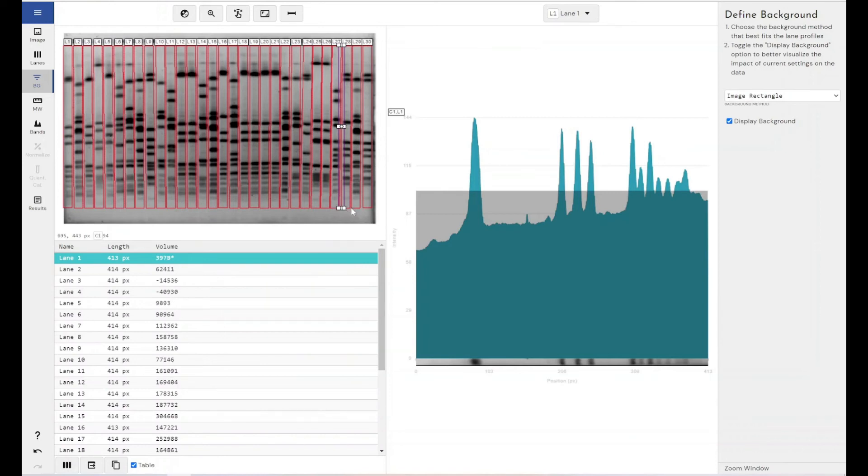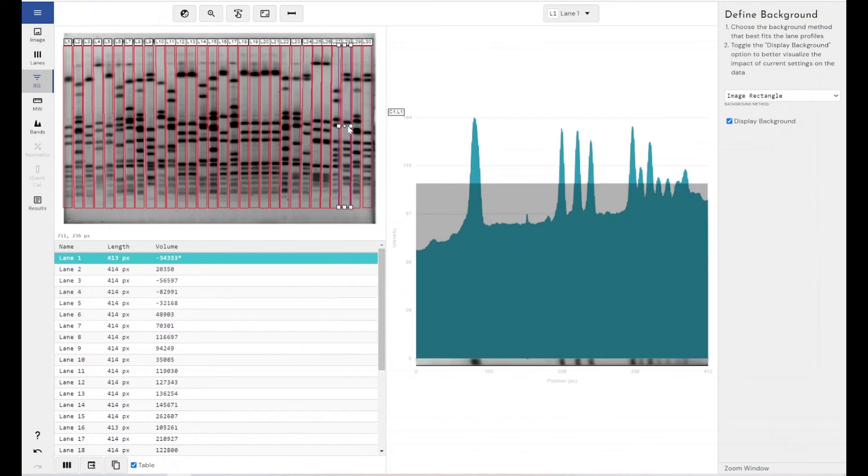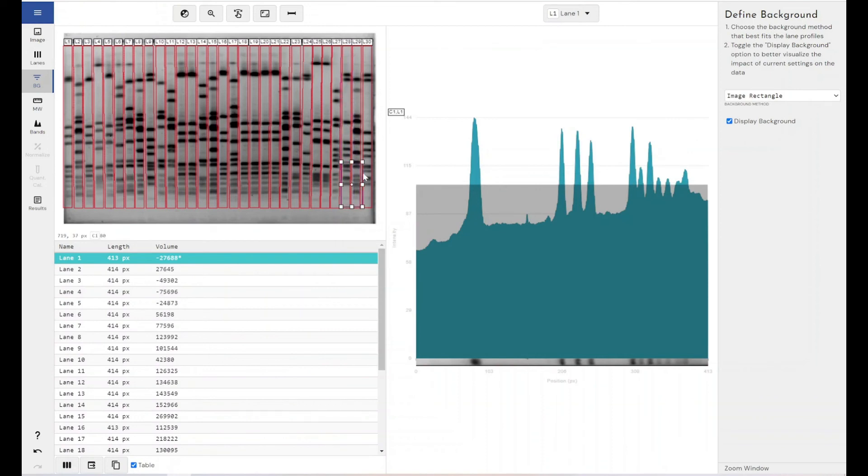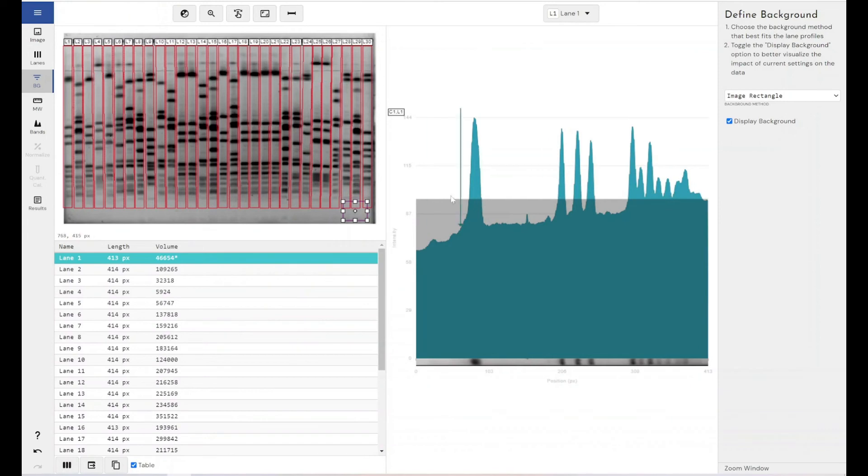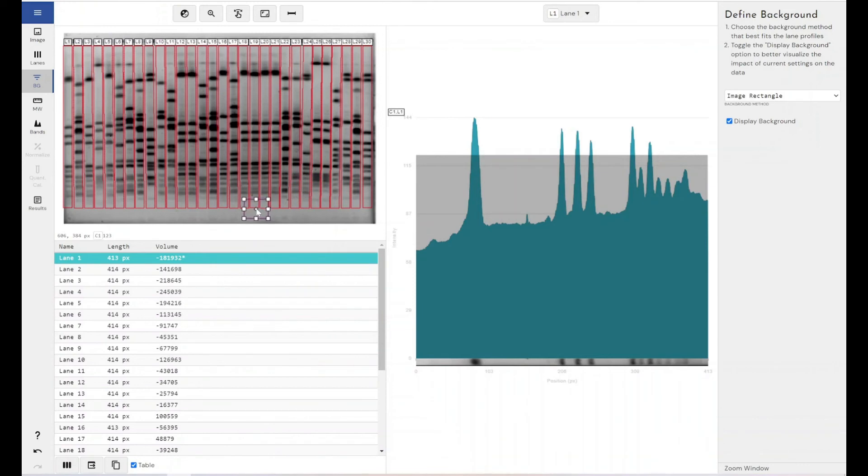So if you had, say, an unused lane within your gel, you could place this over the lane and take that as background and then subtract that from all your other lanes. Or you could use a very small section of the gel where there's definitely not any signal. And you can see as you move this around, you get a dynamic update of what that result is going to look like if you apply this method with these settings.